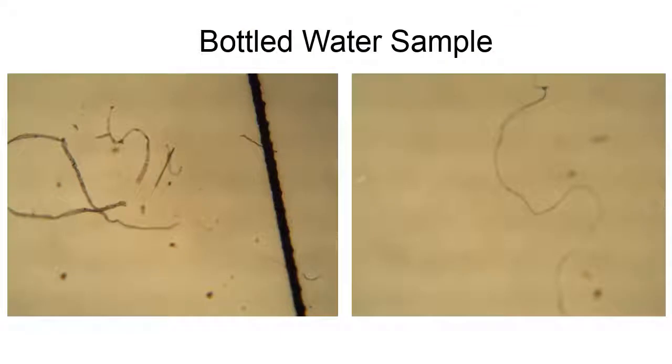Here are two pieces of microplastic that we found in our bottled water sample. You can notice that they are long and thin strips and appear to be clear plastic. These are likely from the plastic bottle itself.